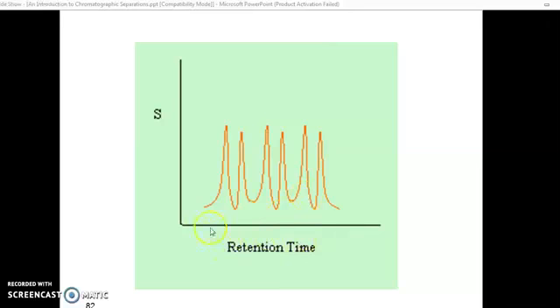okay, as well as the average linear velocity, multiple path factors, and the important things, resolution and retention time. For the retention time, whatever data acquisition, it means you realize all these factors go in the right way, and you find out the retention time, and whatever data comes up on your computerized system, you recognize the data and calculate all your equations and statistical data, and justify whatever results come from your calculations. So this is called optimization, the best chromatographic technique for multi-component mixtures.